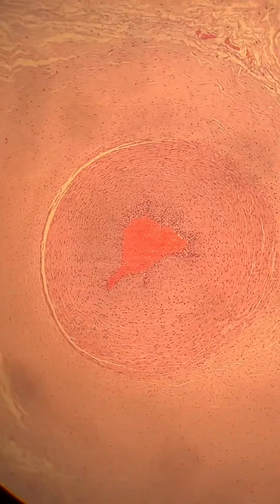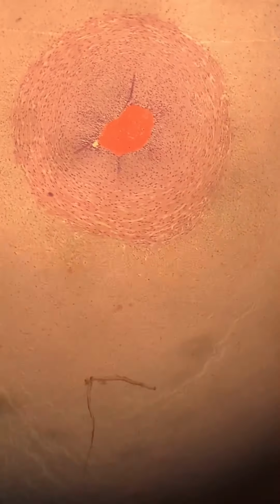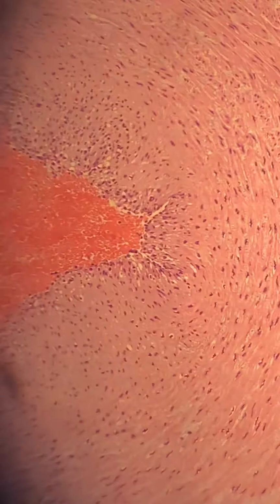So I'm going to quickly show you the umbilical cord from twin B. There's one vessel. There's the second vessel. And there's the third vessel. So I'm going to stop the video and go down and show you the inflammation involved in the vessels. So this is one vessel from the umbilical cord, and you can see that it's markedly inflamed.